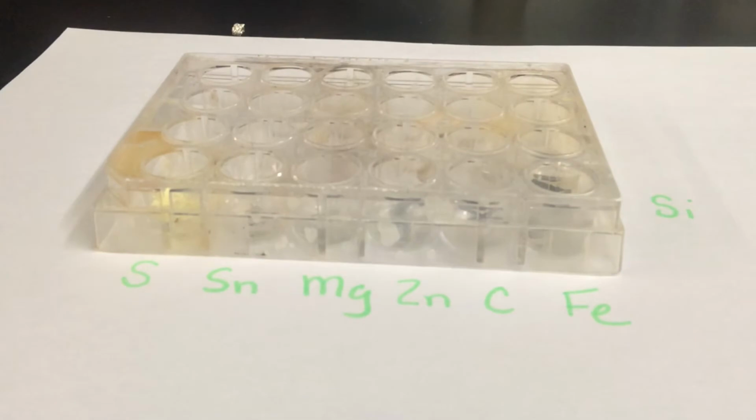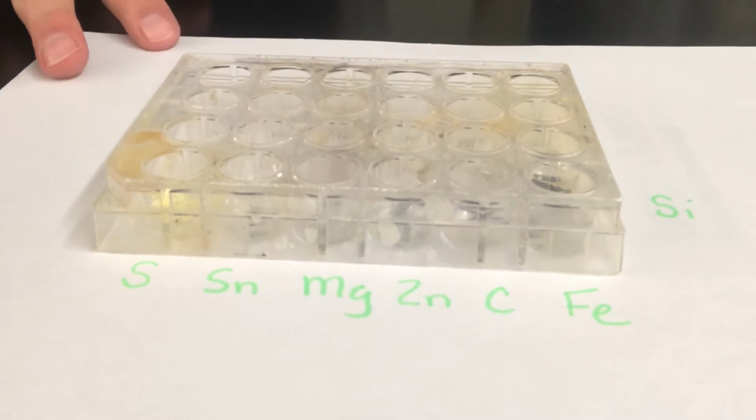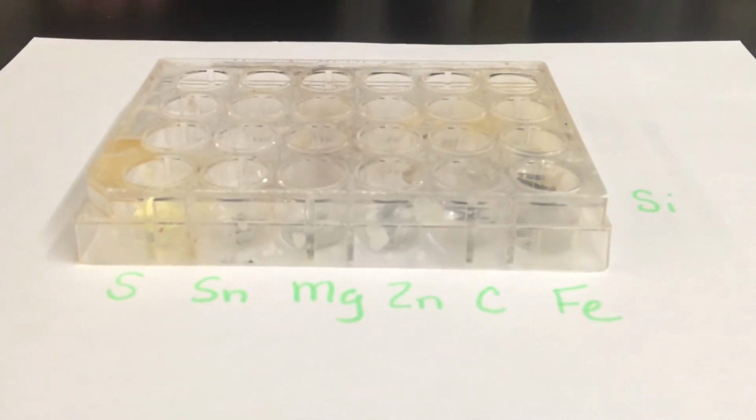So I will let those sit to see if any reactions start forming, and if reactions start forming, I will make a note of it in my data table and let you know so that you can do the same. All right, let's fast forward this and start seeing if any reactions are taking place.